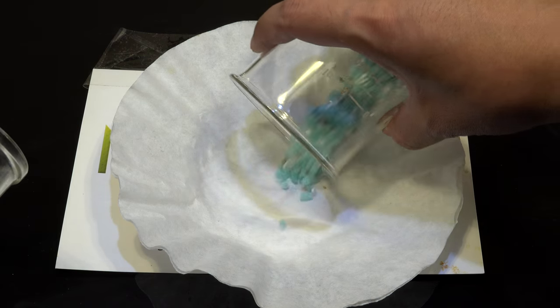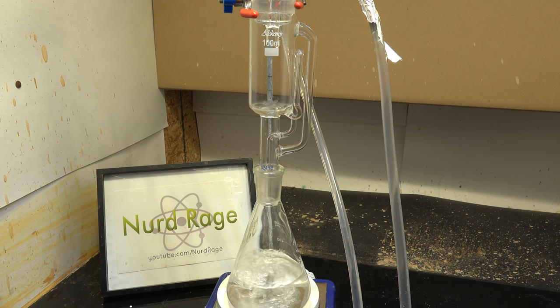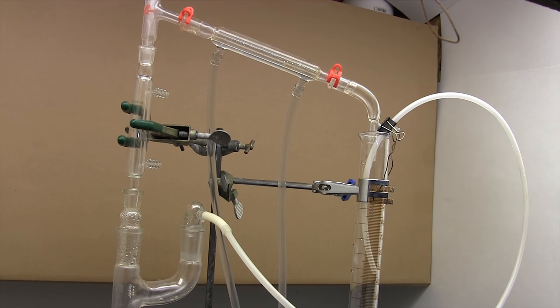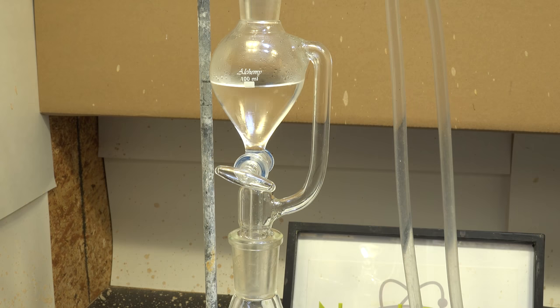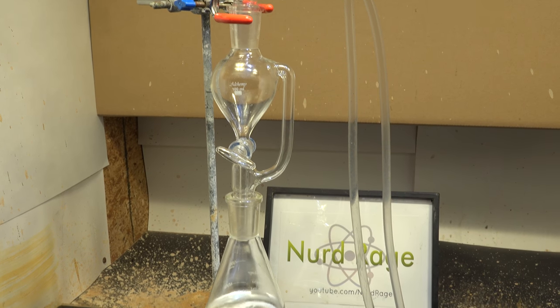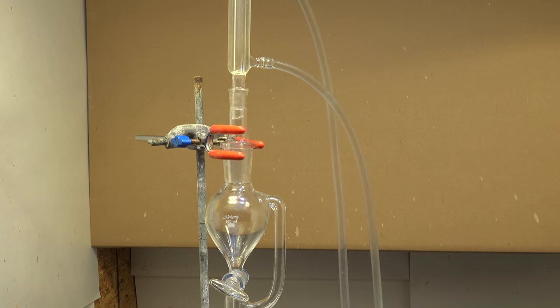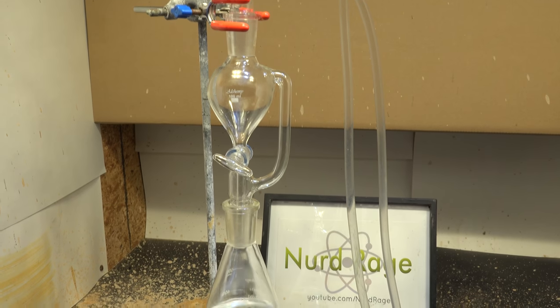Always teabag it. Now, Soxhlet extractors aren't cheap. While you may occasionally be in dire need of one, it may not be often enough to justify the expenditure. Fortunately, similar to my Dean Stark video, we can jury-rig a working, albeit poorly performing version for those occasions when you're in dire need of one. All you need is a pressure equalized separatory funnel with ground glass joints and matching boiling flask and reflux column. Most labs already have these parts.